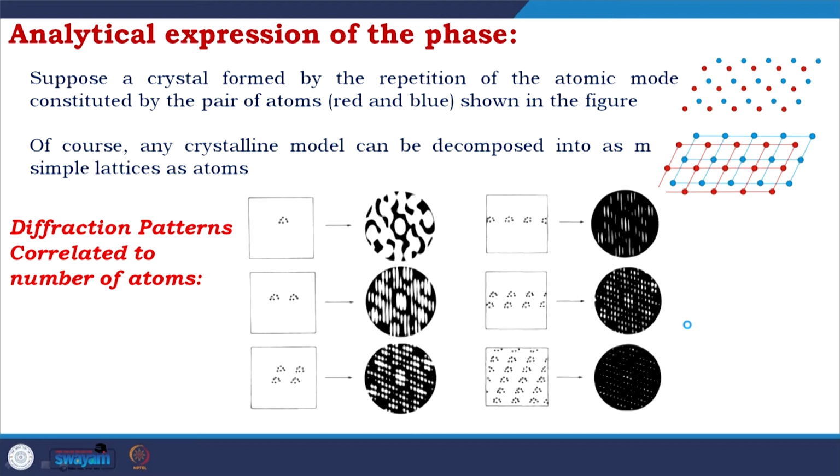These are couples where you have a lot of molecules in one array and you get a spot. So, this is kind of a 1D array. Here you get 2, but it is not 2D, it is still 1D, but here you have the molecules in 2 groups and then multiple groups.